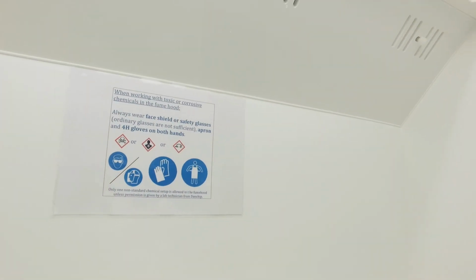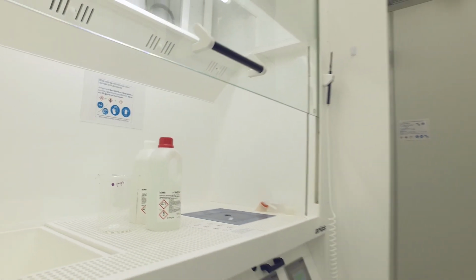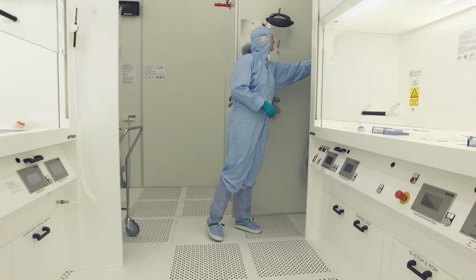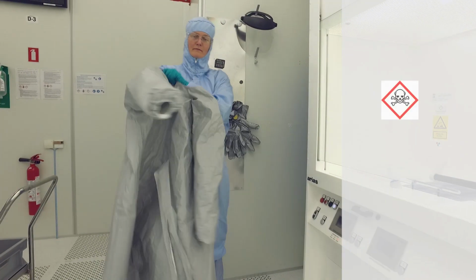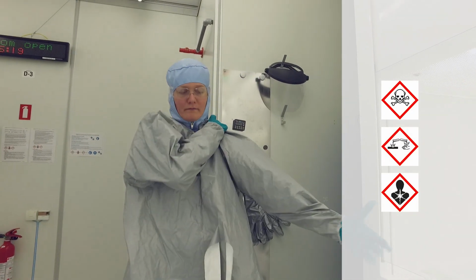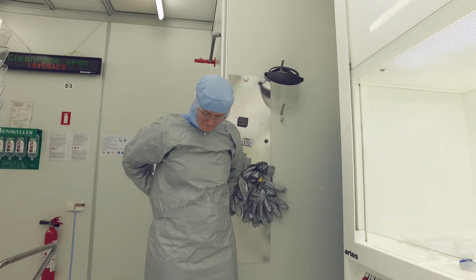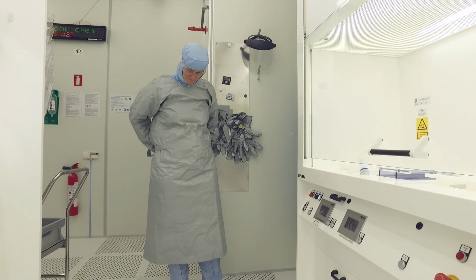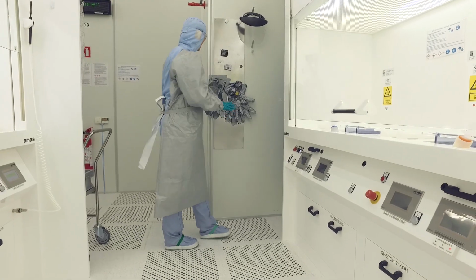In some work areas, you must use additional safety equipment. You'll find signs telling you which safety equipment is to be used in areas where we work with wet chemistry. Any work involving chemicals that are labelled toxic, corrosive, or that pose a serious health hazard always requires additional protective equipment. For other work, safety glasses or normal glasses are sufficient. If there are specific rules for certain baths, it will be on the signs at the bath.